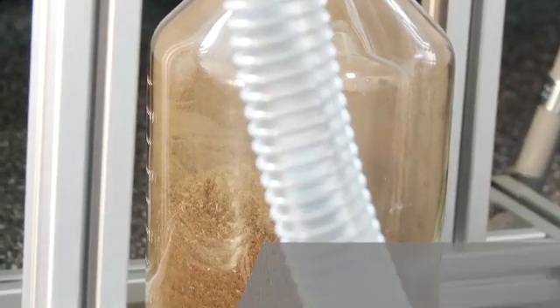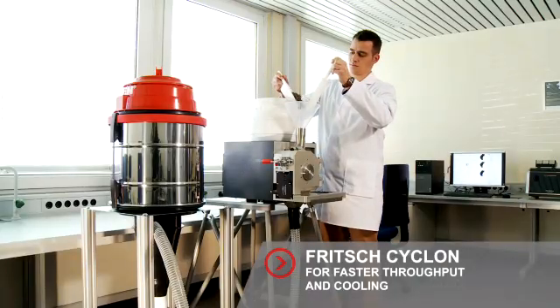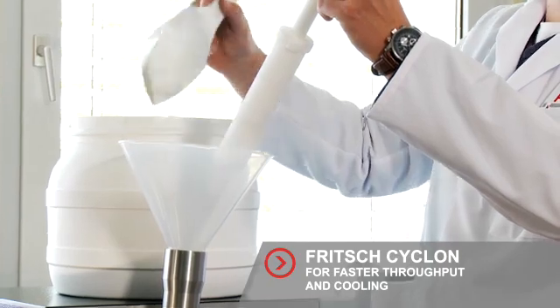Work even faster with a Fritsch sample exhaustor with cyclone separator. The sample is aspirated with negative pressure. The advantage? An even faster throughput and good cooling.